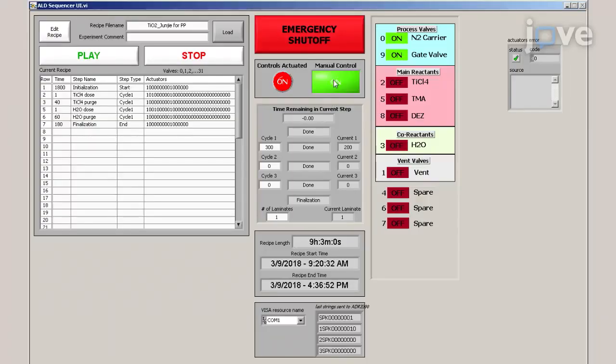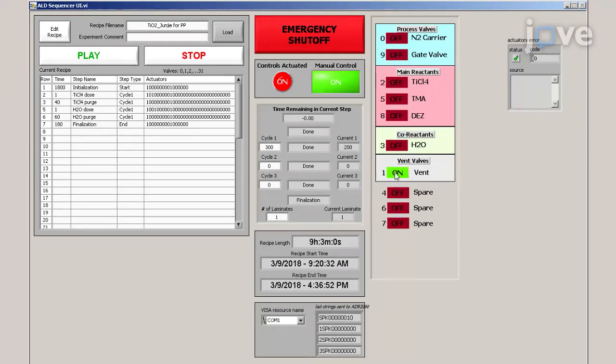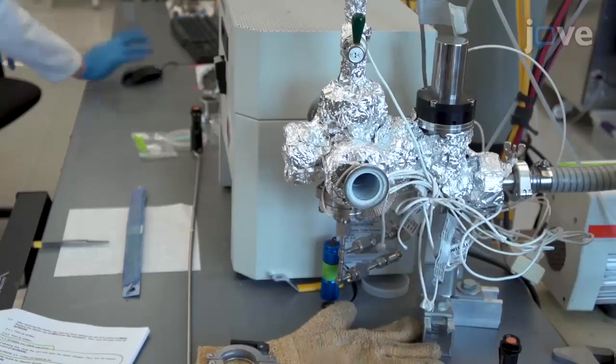Turn on manual control in the LabVIEW system. Close the carrier nitrogen and gate valve on the ALD reactor. Then open the vent nitrogen. The reactor will open and the cap will fall off.